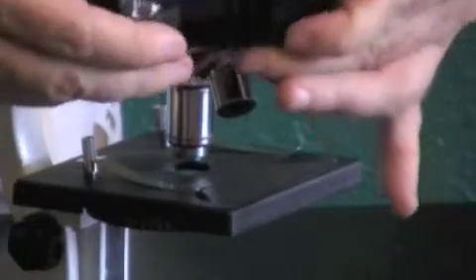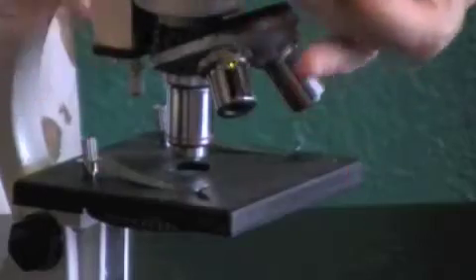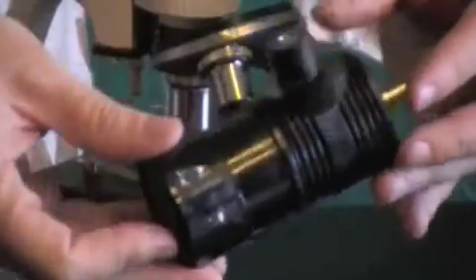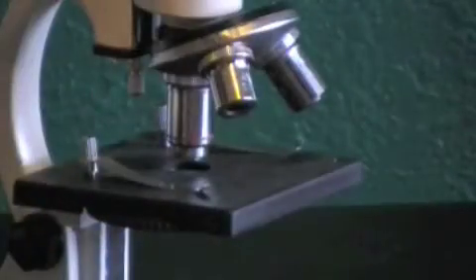But it should work fine to begin with. And if it works fine to begin with, don't mess with the batteries. But if your batteries go out, you need to replace them. So you've got your power switch here. You've got your light here. All you do is flip the switch on and ow! Ow! Ow!